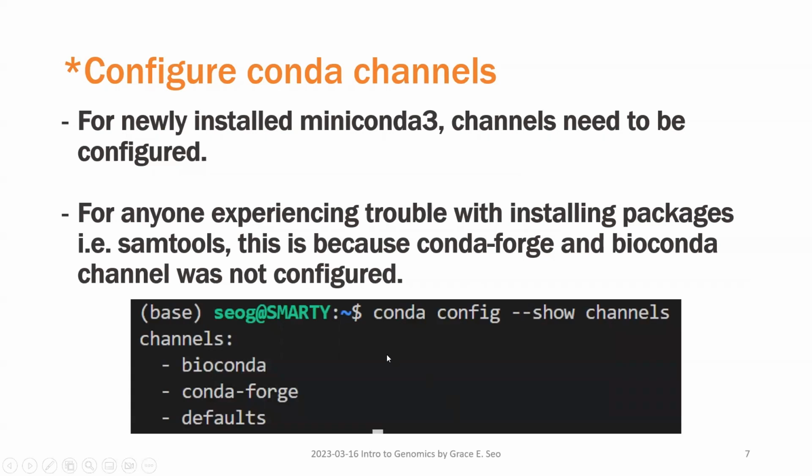If you attended last week's workshop, or if you watched online on YouTube, you probably got to installing Miniconda 3, and you probably didn't realize if you didn't install SAMTools, because SAMTools was the one that had a problem. For anybody who newly installed Miniconda 3 for this workshop, your channels need to be configured if it's your first time.